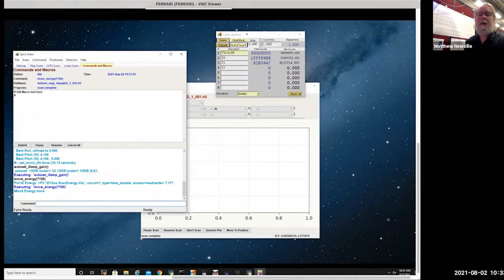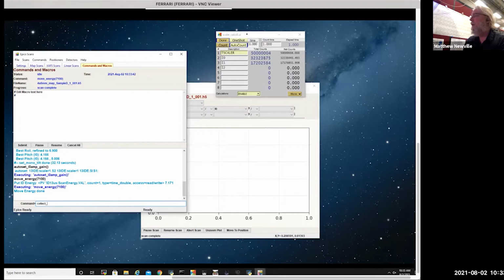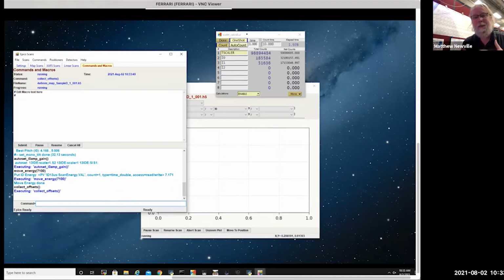And that number jumped up. That's the edge. In fact, that looks pretty good. So now that's like 1.7 volts, and I'm happy with that. I'm going to deliberately say collect the offsets, because when we use these electronics for the ion chambers, there's a small offset so that we know that we collect zero. We know that any bias or change in the amplification allows us to have a positive signal when the current is off. So I closed the shutter and I saw that there was a positive number, and now I'm going to subtract that number to get the real current. It makes a small effect, but it could be the difference between decent data and good data.